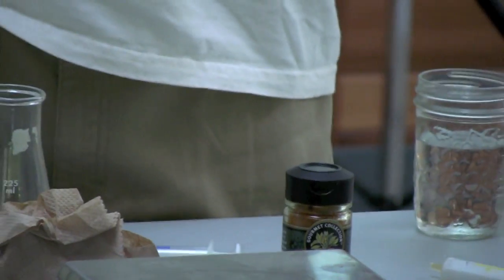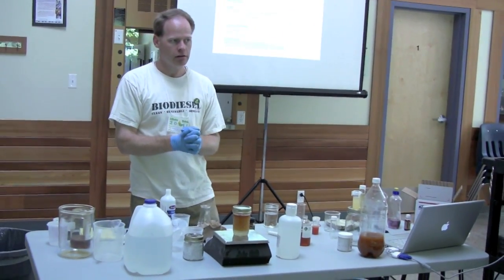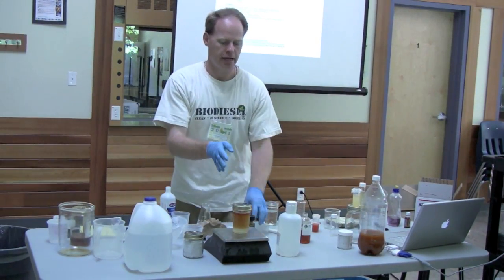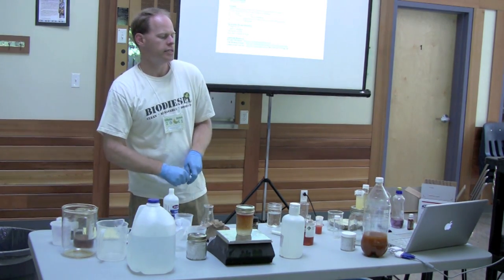Yeah, that's settling out really quick too. Good. Is there a critical time to leave that for to check it out? I like to leave it for at least an hour. I didn't shake it real hard, and we don't have an hour, but I like to leave it for at least an hour and come back and look at it. And the 327, the same thing? 327 is 5 minutes.